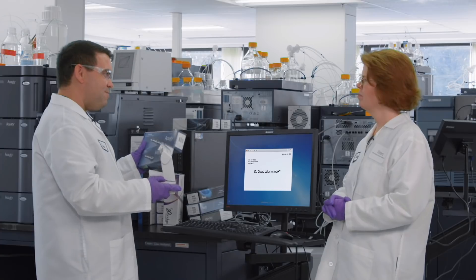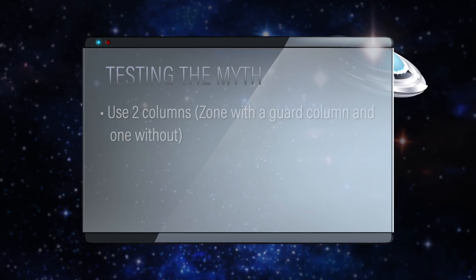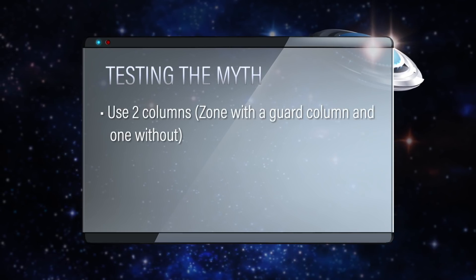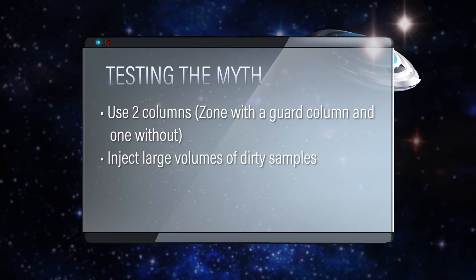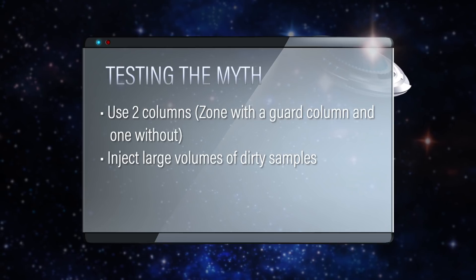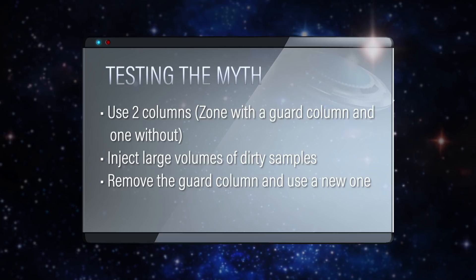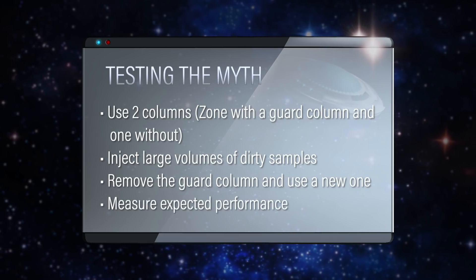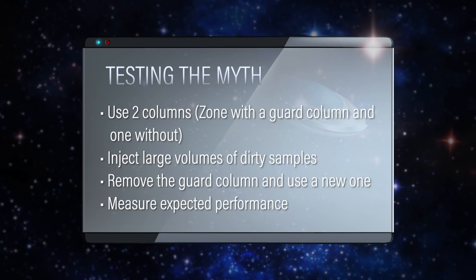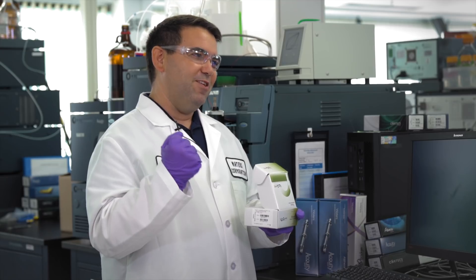So how do you want to set up the experiments? We can use two columns — one with a guard column and one without. For the one with the guard column, let's inject large volumes of samples and push it to the limit until we can't get good chromatography anymore. Then once we hit a certain point, we take the guard column off, put on a new one, and see if we can bring back the performance and back pressure to expected levels. Then we'll know if the guard column did its job.